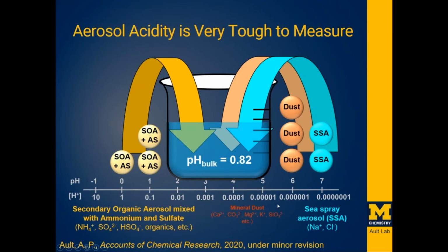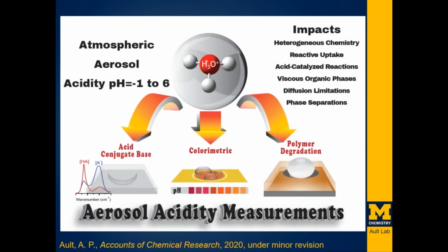And so this is why we want to understand particle pH at the single particle level. We've developed a number of methods in my lab. We have an acid conjugate base method.